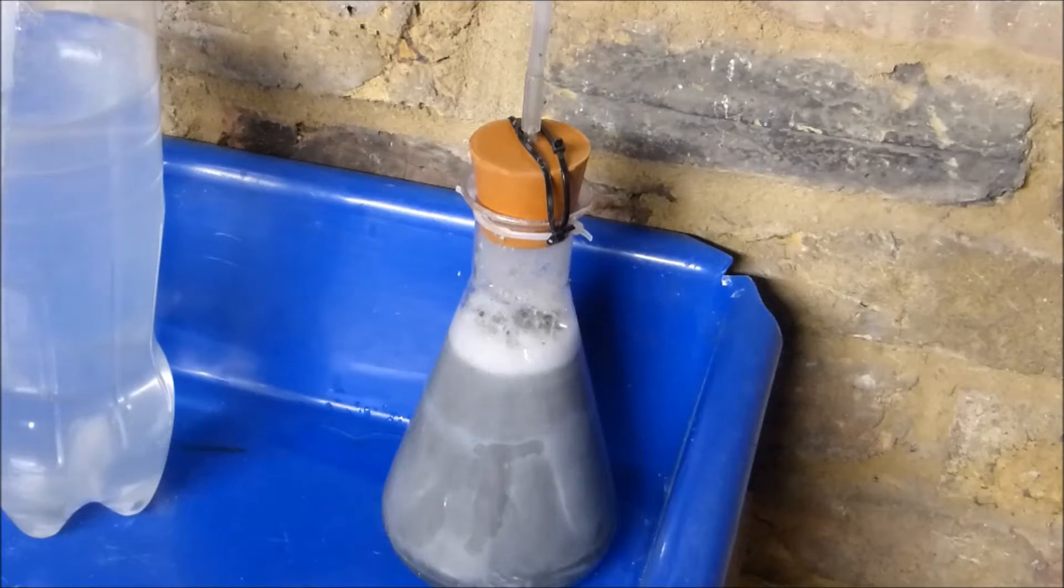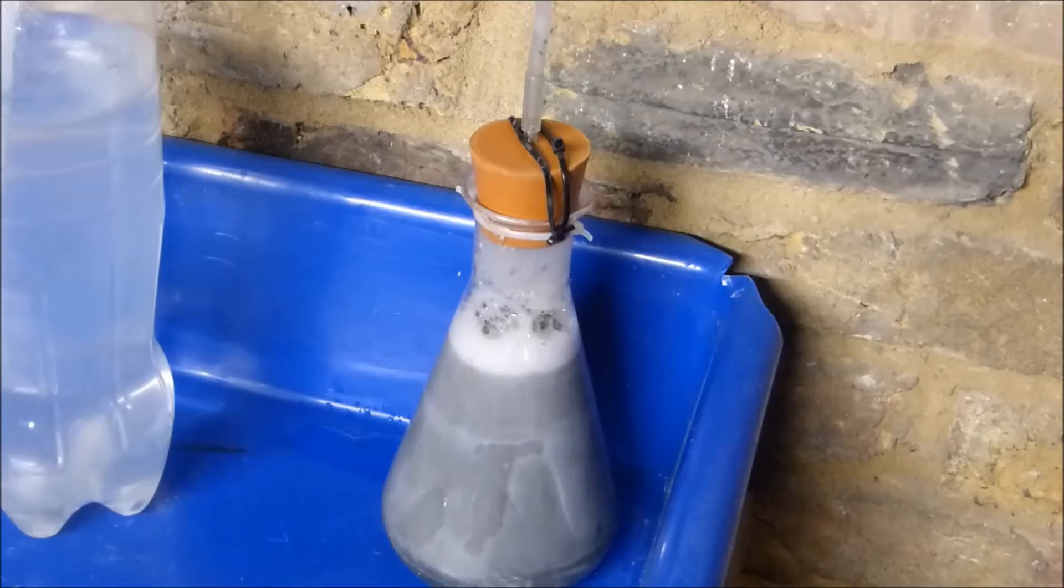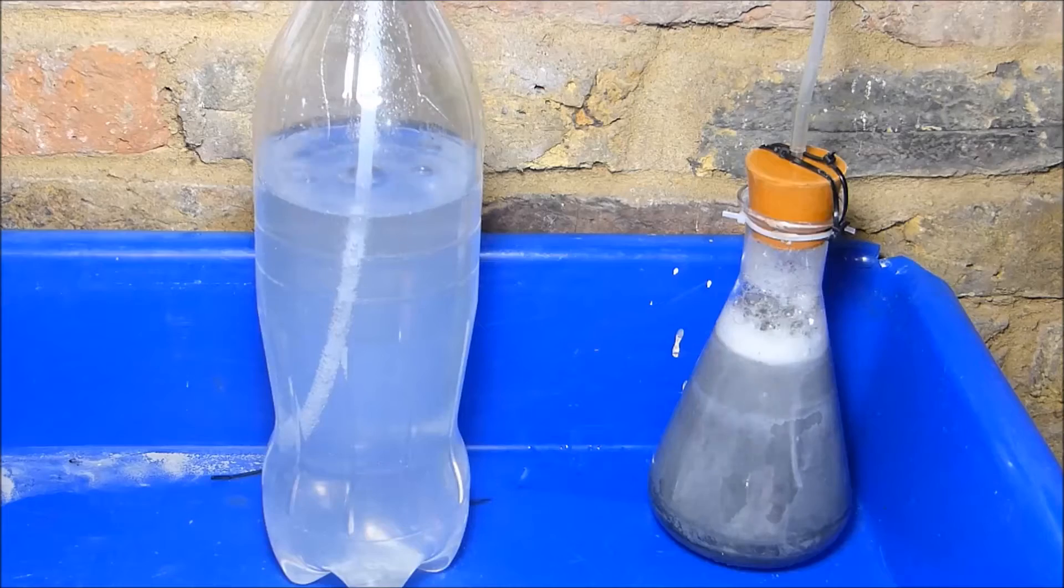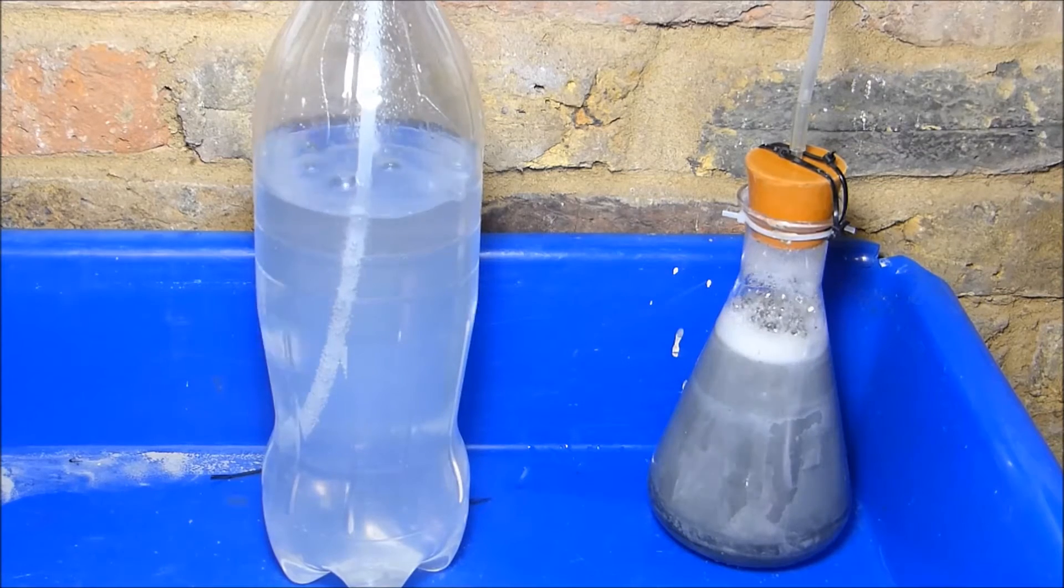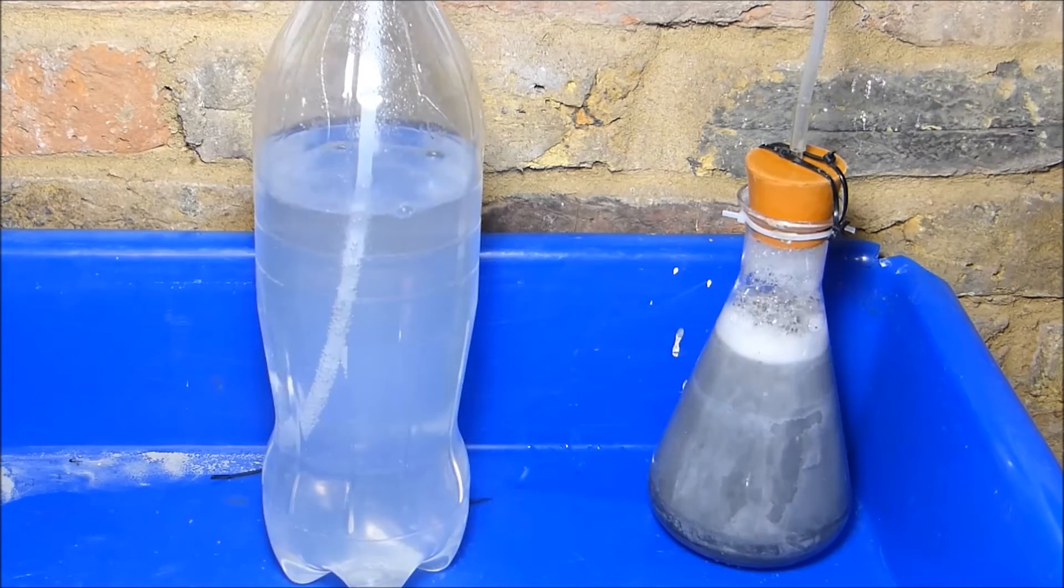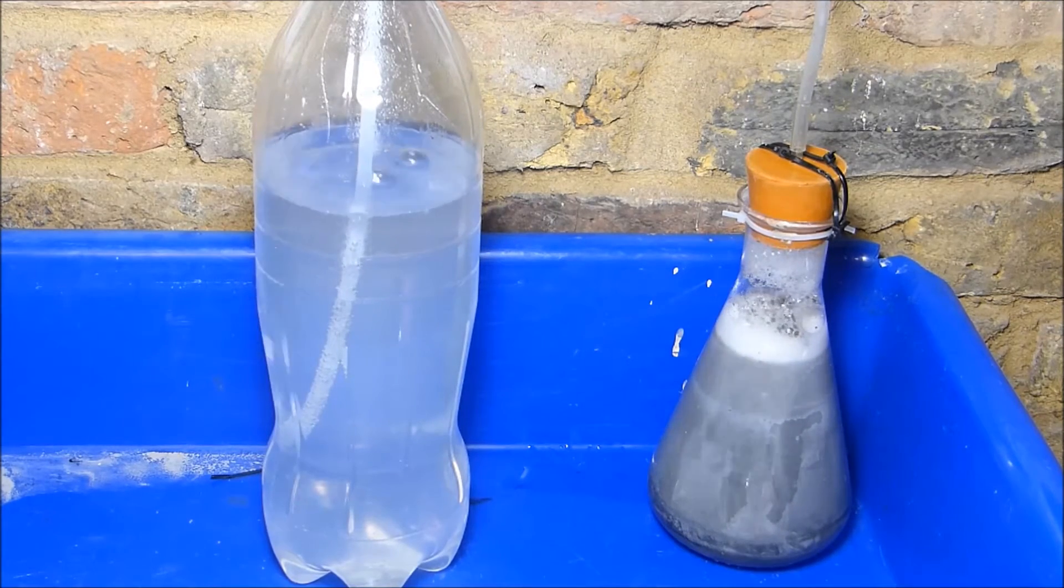The hydrogen is created in the flask and it's an exothermic reaction so it heats up rapidly. This creates water vapor which can carry traces of the sodium hydroxide. To remove as much of this as possible we pass the gas through a bubbler which is the soda bottle filled with water.